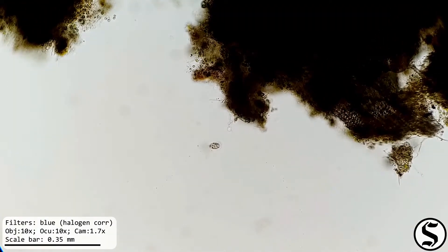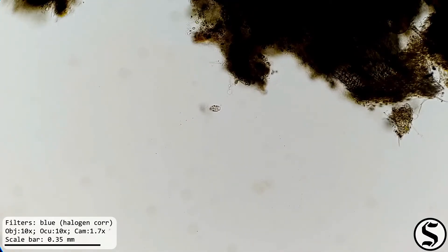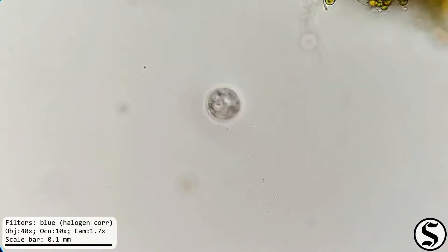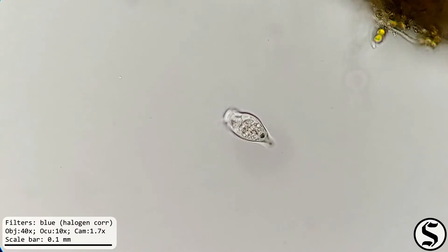Here's an Opercularia that's decided to grab onto the slide. Here's an interesting top view that I don't usually see. And then it shifted a bit so I could get a side view.